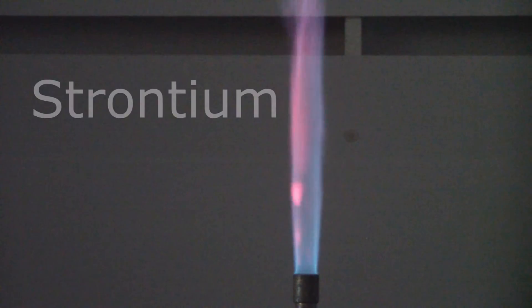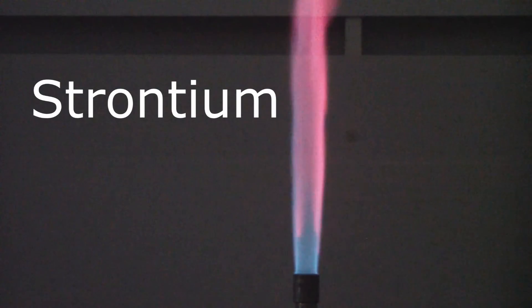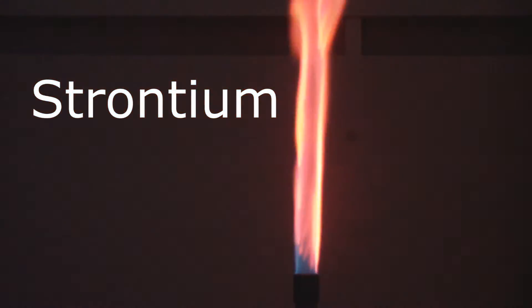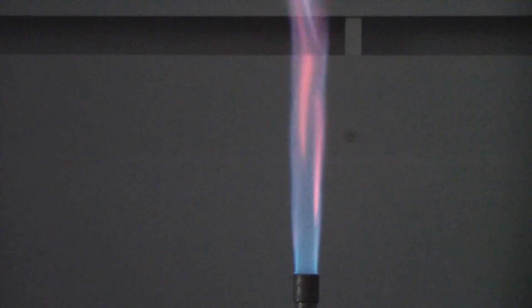Moving on to strontium. Spray that in. We get a nice little red-orange, so moving on up a little bit in that color spectrum.